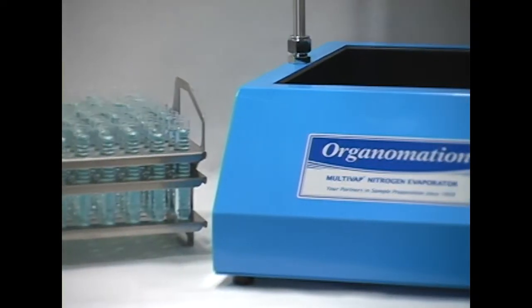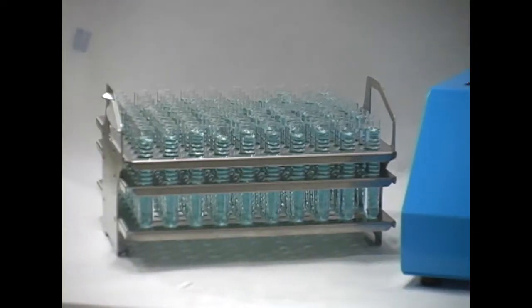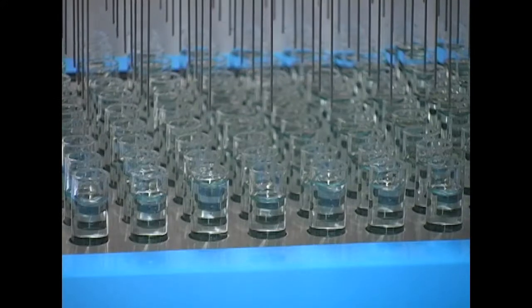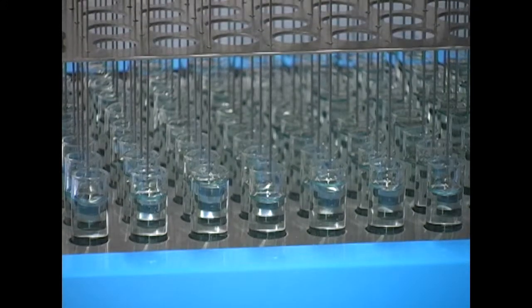You provide us with your test tube measurements and we will customize the sample rack to match. The nitrogen distribution array raises and lowers as a unit, making it easy to start and stop evaporation to all samples at once.